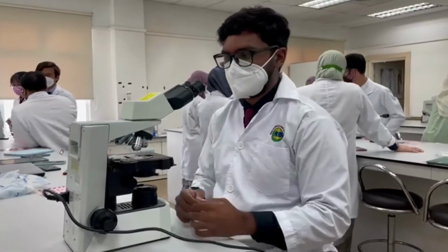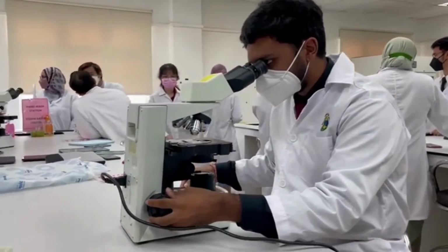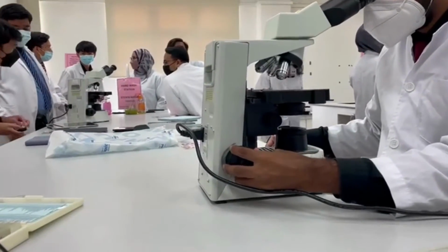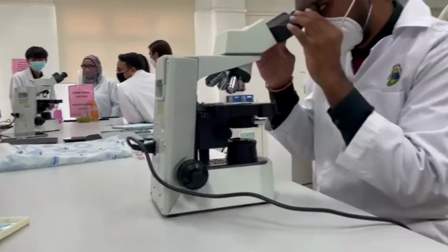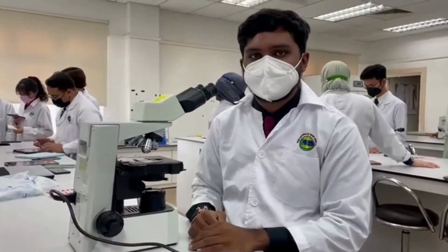Use the coarse focus knob to focus the slide as best as you can. Take your time and make sure that the lens isn't too close to the slide. Contrary to popular belief, getting too close to a microscope or sliding it too close to the lens can make it harder to see. It reduces the field of vision.